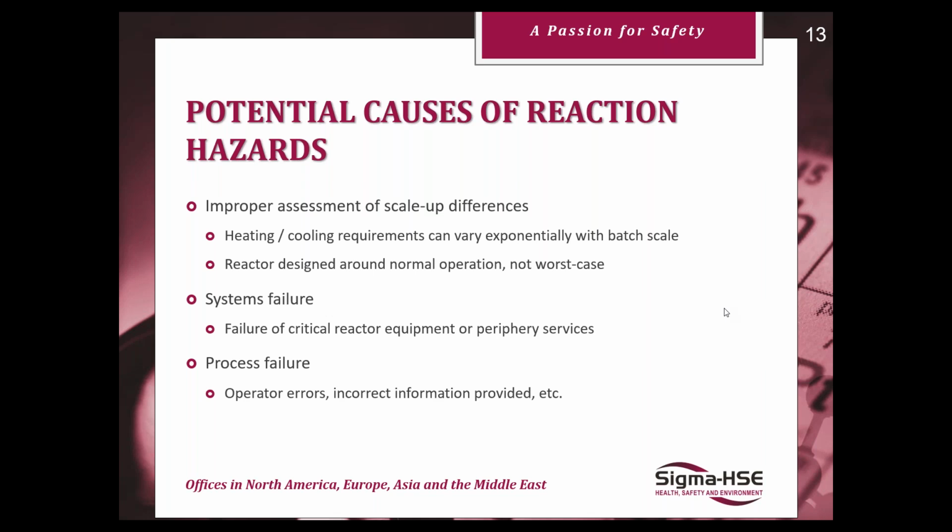Also, what can come under improper assessment is if the reactor is only designed around normal operation, so just dealing with heat output from the desired reaction, but not considering worst case scenarios, which is where our thermal stability screening comes in. That's looking at the worst case scenario and potential decompositions. These aren't the reactions we want to happen, but we need to be cognizant of what happens if they do occur.